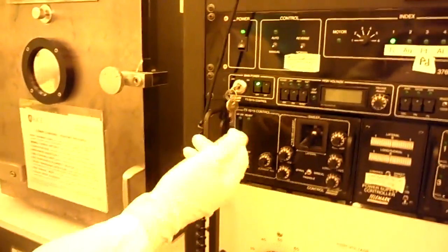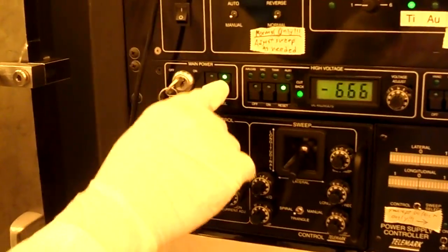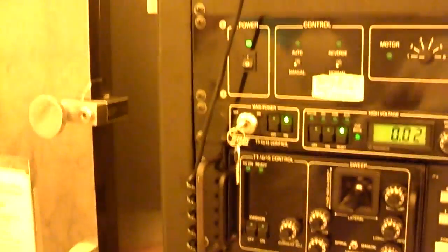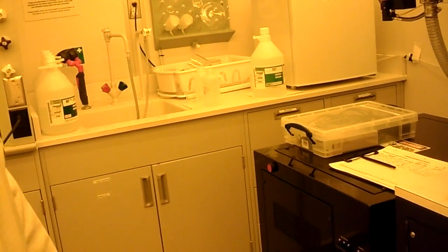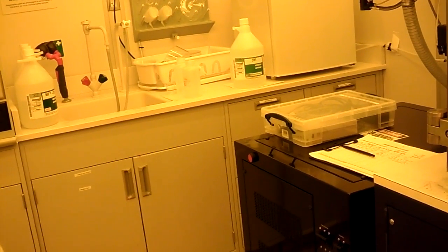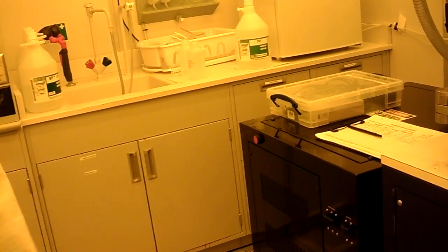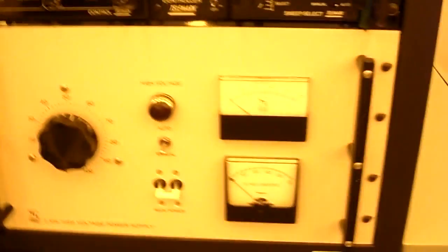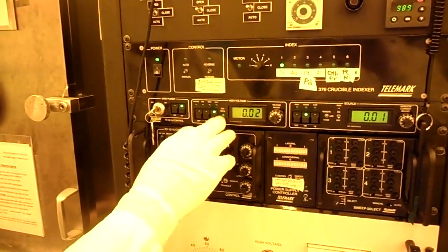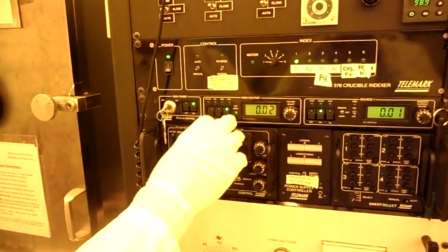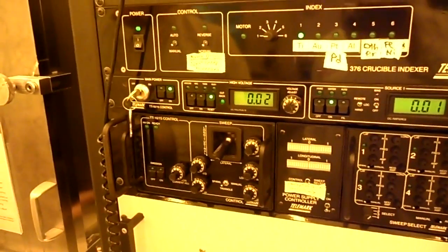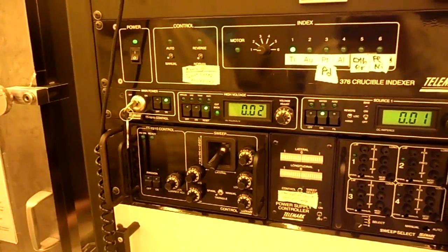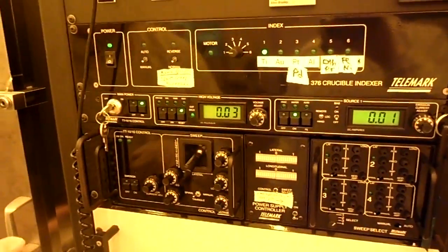So to turn on the high voltage, it's a series of on buttons. First of which is the breakers on the high voltage box, that's the external power supply. Then you turn the key on. Then you press the on button, and you wait for it. Now, what you're waiting for is your fans and relays, high voltages, click over. When that's done, you're ready to proceed. So now the fans are running. If you can see this light here, this is what's called a cutback light, flashing briefly when they turned on. And that's to be expected. I'll explain that later.